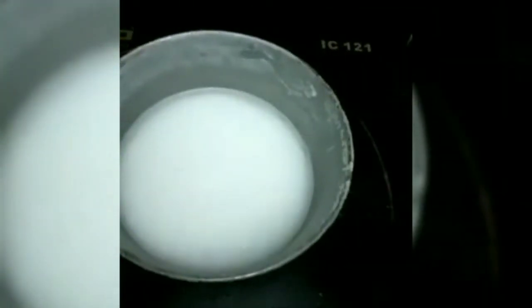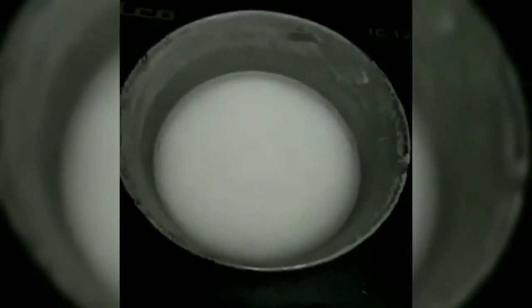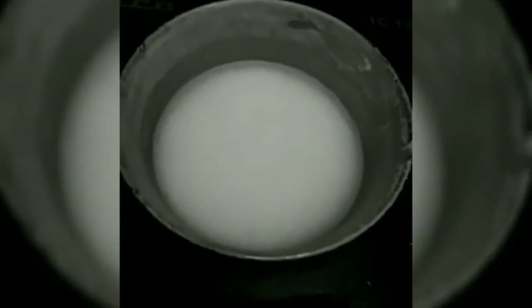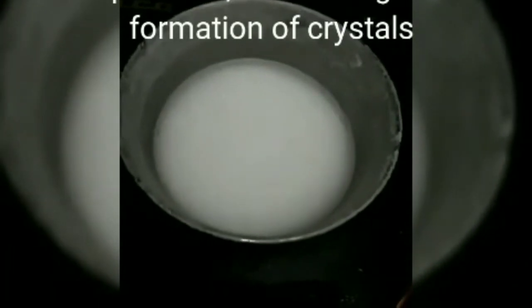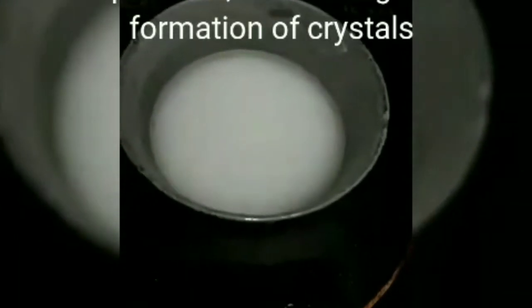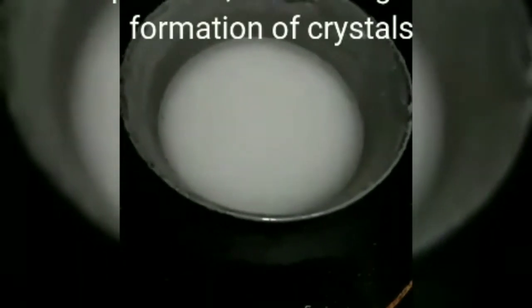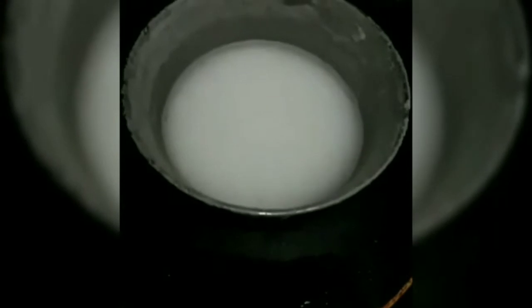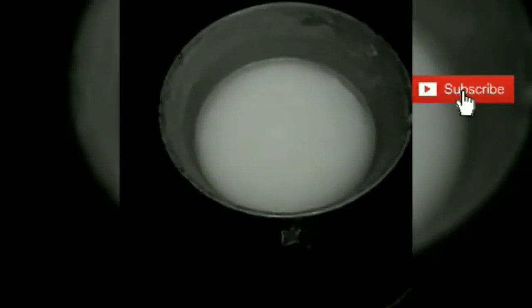Most of you must be thinking why can't you cool it down quickly in a freezer. This is a great question. If you put the solution in a freezer after heating it to very high temperatures, there is a sudden drop in temperature, and a sudden drop does not lead to the formation of nice crystals — or may not lead to crystal formation at all. So we cool it at room temperature to get nice crystals.